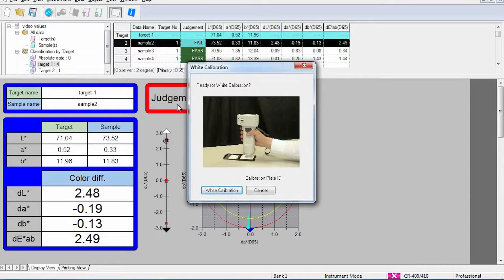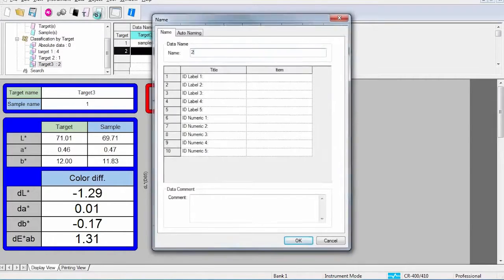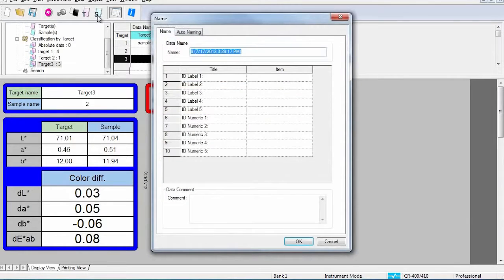This user-friendly software makes it easy to inspect and control color whether your color control involves incoming raw materials, production, or research and development. With just a click of a button, pass or fail assessment can be determined. Users can also upload data directly into the quality control software, allowing for simple and complex evaluation.